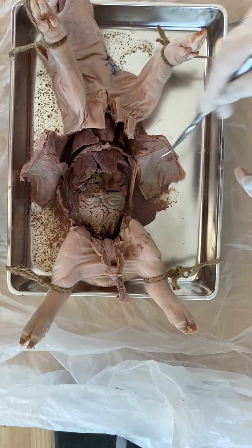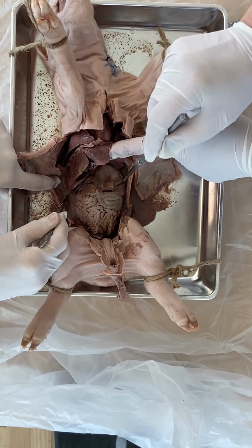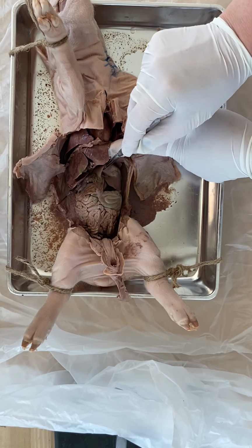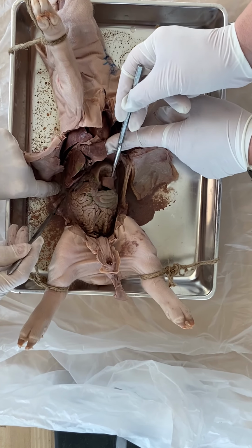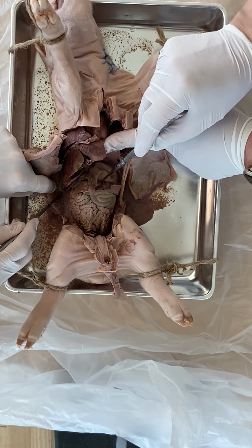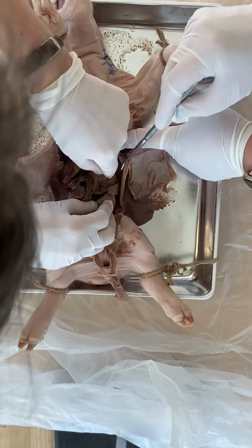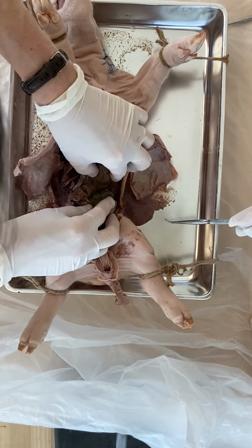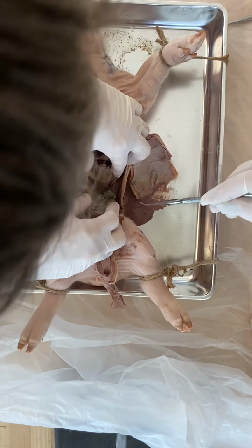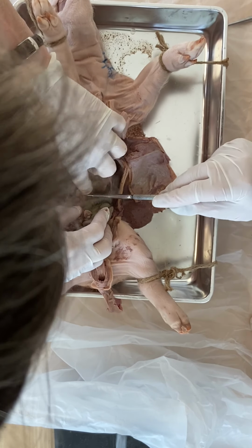We come down underneath, and here is the stomach. And this is the spleen here. Where's the pancreas? Is that it down there? It's under the stomach. Usually you lift the stomach up and the spleen up out of the way. It'll be under there. Do you see it? I think that might be it.